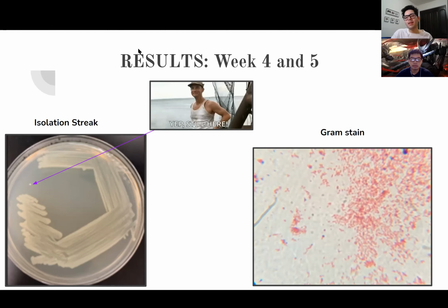And then, as you can see in the gram stain, it is gram negative, and you can see the uniformity, the purity of the cells present. They are bacillus shape, but they're also kind of circular, so they're like coccobacillus. They're in a staphylococcus arrangement, or staphylo arrangement. Some are diplo, some are singular, but they're basically all clustered together. And as we can see here, they're rather pure cultures just because they are rather uniform throughout.